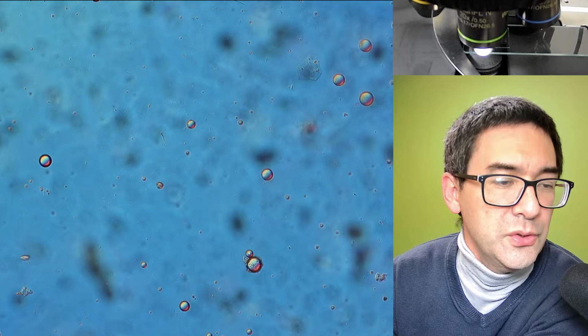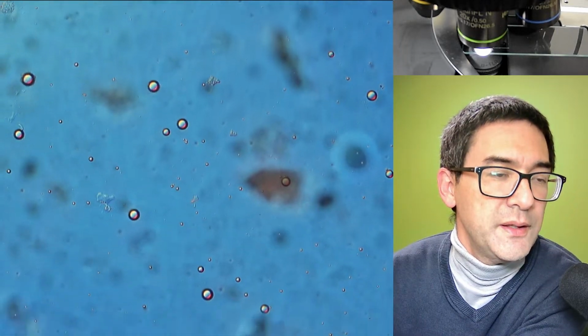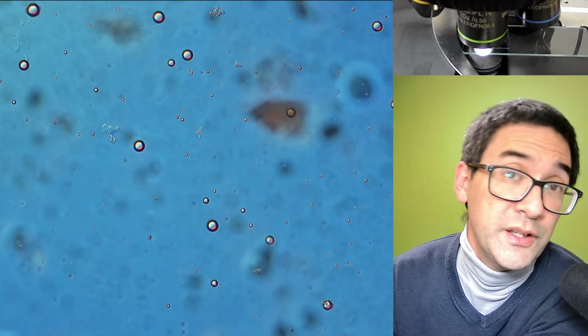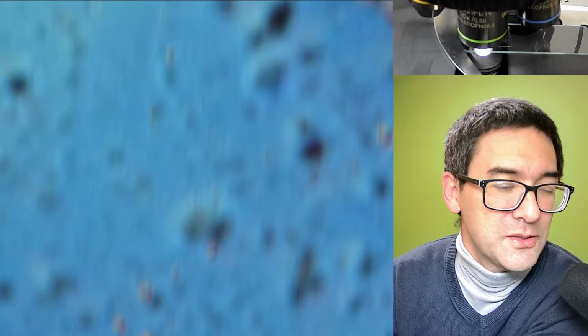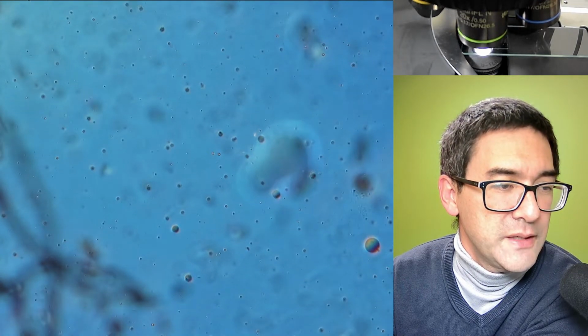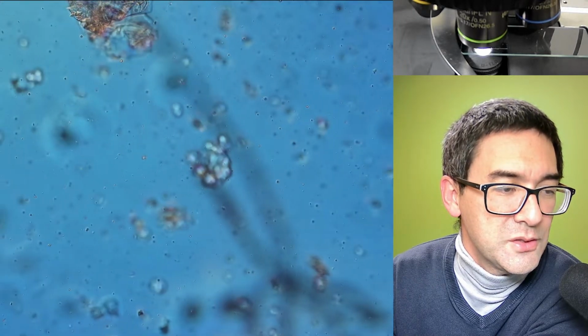I just read over here that there's a question about salt, and indeed, what you can do is if you apply a little bit of salt water on one edge of the cover glass, paramecia and some other microorganisms will move away from that region to the other edge of the cover glass, and that's one way how you can actually concentrate them. But if you add too much salt, of course, you're going to kill them off. That's also clear. Right? So, okay, this actually shows a little bit of what I kind of expected, that all of my little critters here seem to pass this one chip challenge.